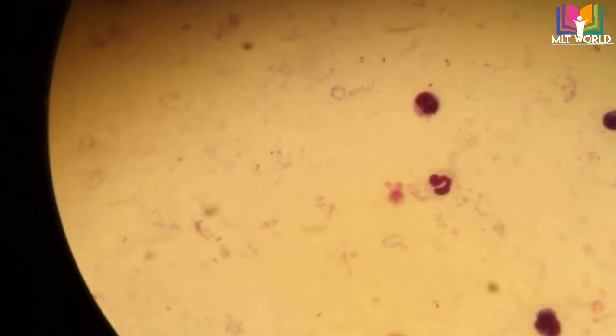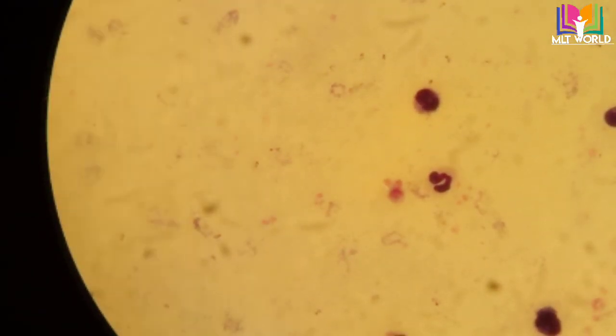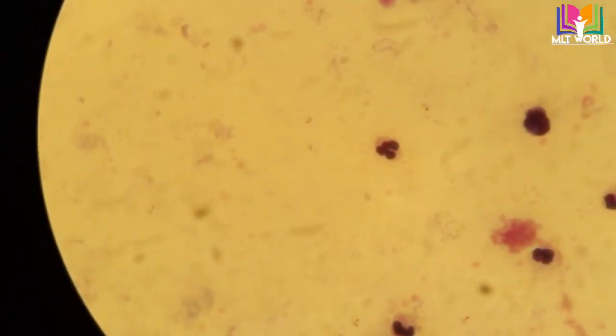Now I will show you how it looks in the thick smear. All RBCs are lysed and only WBCs are there. If malarial parasites are present, only the parasites will be seen in the thick smear along with white blood cells. I will try to focus — there are small malarial parasite rings; I hope you can see them.